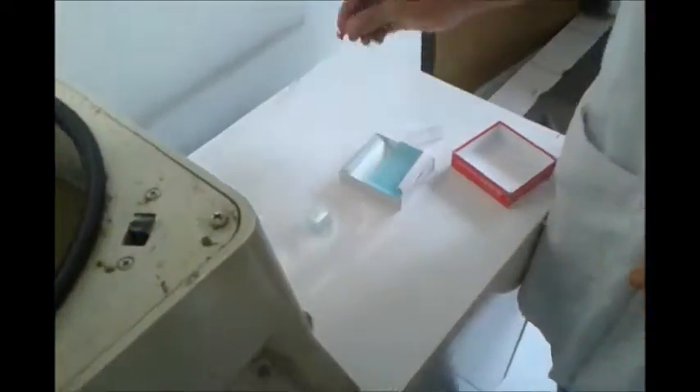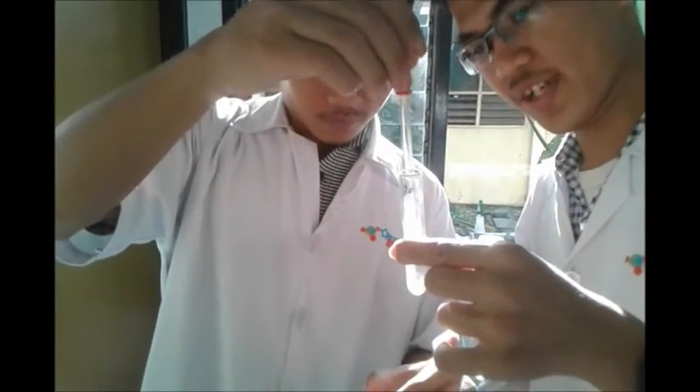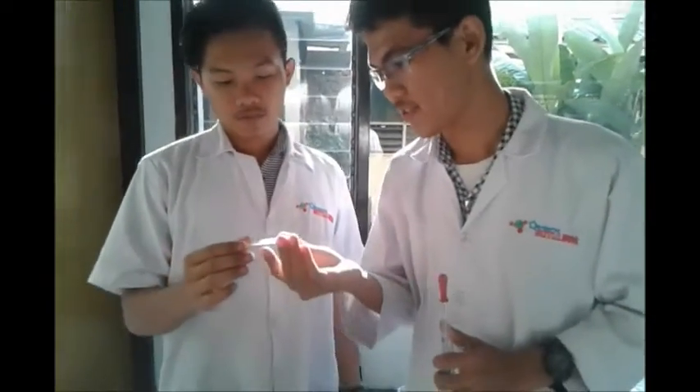Okay, we go to this table. This is my partner who will show you about taking sediment from the sample. Okay, we take this with the dropper. First, you must homogenize it first. And cover it with the cover glass. Okay, this is the sediment and it is ready to see under a microscope.